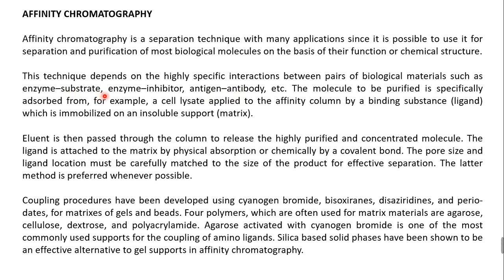These interactions are very specific. For example, one enzyme will interact with only one substrate, and one enzyme will interact with only one inhibitor. The antigen-antibody interaction is also 100% specific. One antigen will bind only with its antibody. There is no cross binding, and any other non-specific binding will not be possible. That is why this type of purification is very famous, with very specific binding, and you can specifically purify your protein of interest.